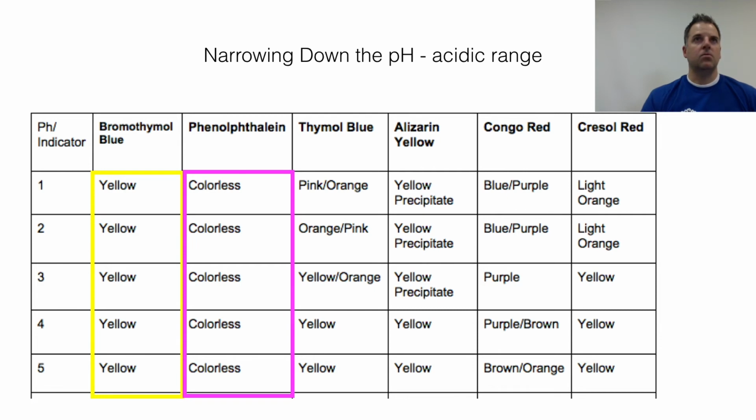So by that, what we want to know is, can we narrow down the pH range? And with phenolphthalein, we couldn't, because we already know it's going to be colorless. So putting phenolphthalein in our water sample would not help. So another option would be to use thymol blue.